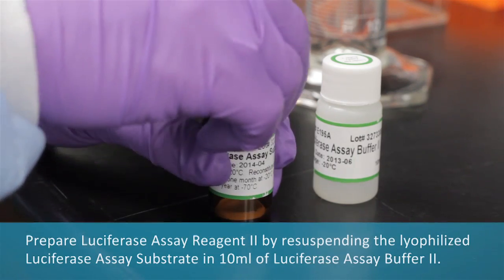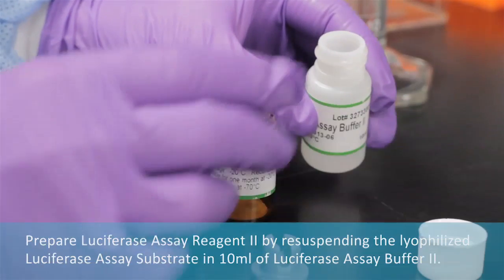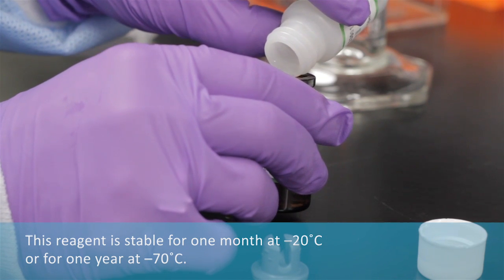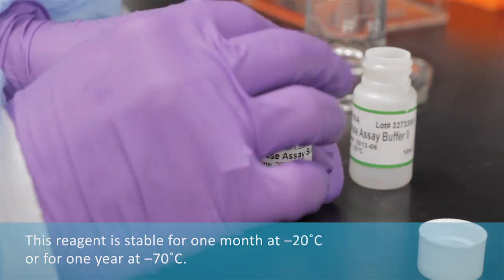Prepare luciferase assay reagent 2 by resuspending the lyophilized luciferase assay substrate in 10 milliliters of luciferase assay buffer 2. This reagent is stable for one month at minus 20 degrees Celsius or for one year at minus 70 degrees Celsius.